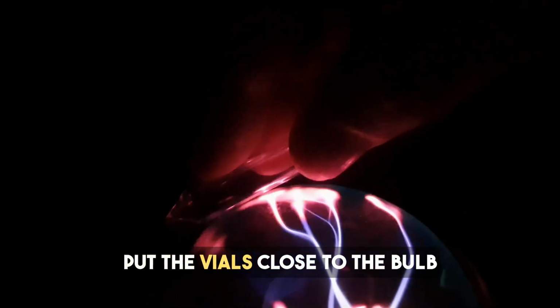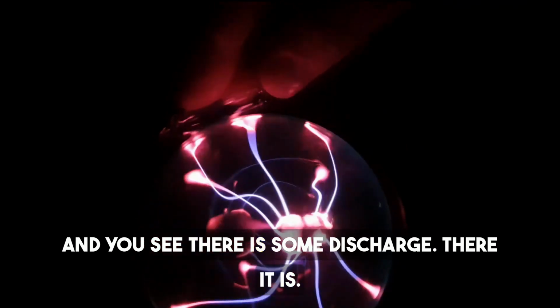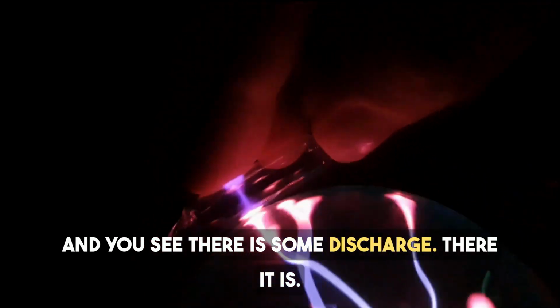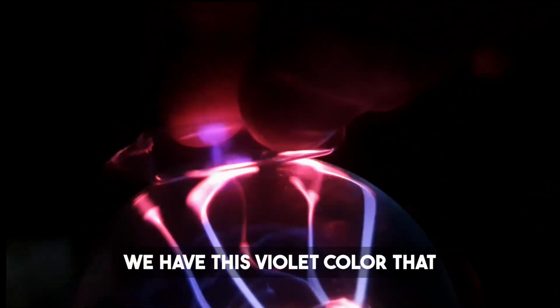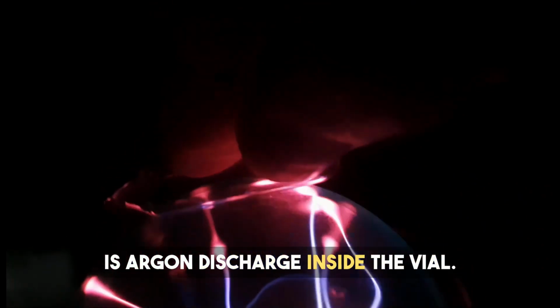Put the vial close to the bulb, and you see there is some discharge. There it is. We have this violet color that is argon discharge inside the vial.